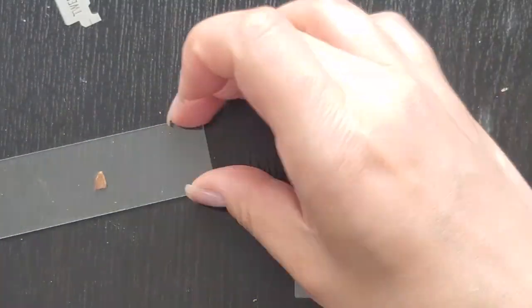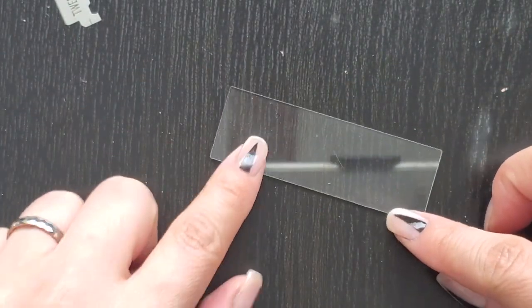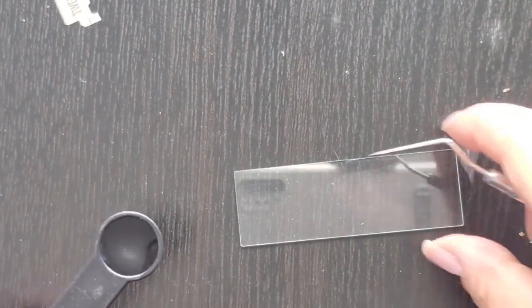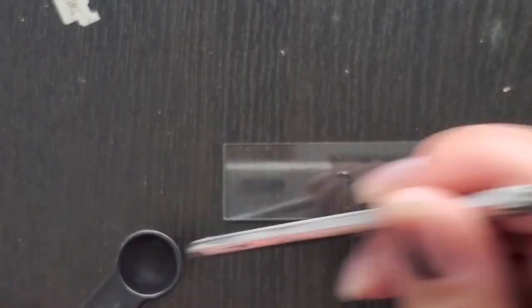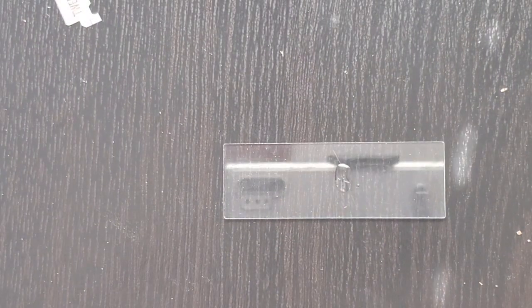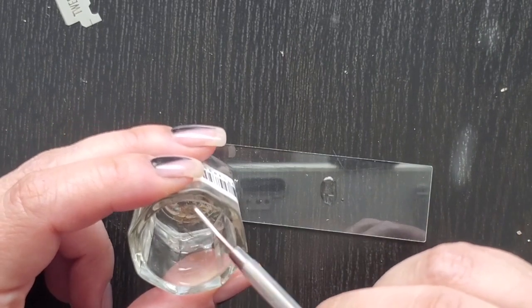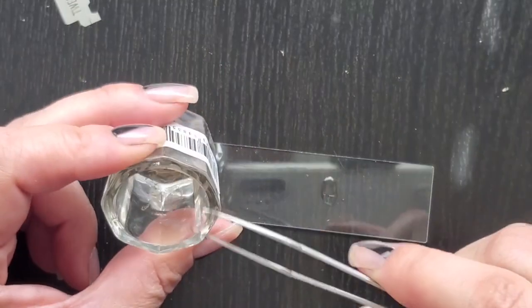So let's go right ahead and use this same slide. And here instead what we're gonna do is we're gonna put a droplet of water to rehydrate the piece that we wanted. And now I need to go get water. All right, I got lazy and I put water in a measuring spoon. So what I usually do is the back of the needle, and you're looking for the thinnest pieces. Sometimes it's easier to just use forceps.